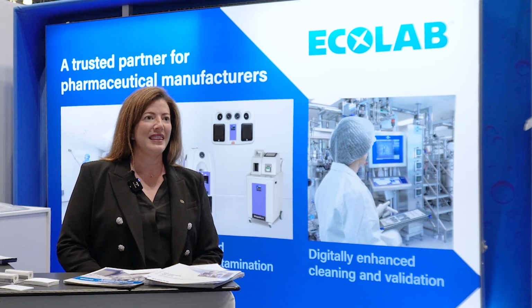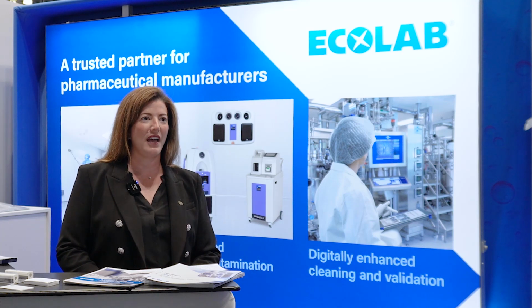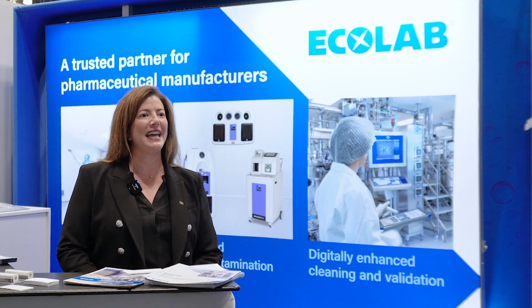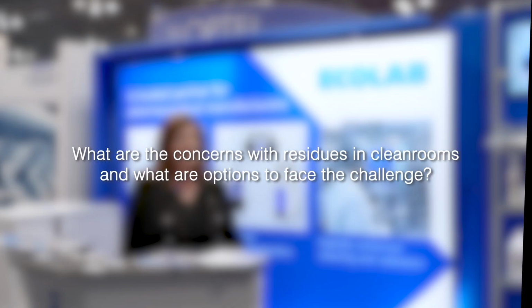And finally, the Annex clarifies the term cleaning and disinfection. And we feel this is extremely important because the role of cleaning helps get to that surface such that the disinfectant can be more effective in the outcome that it is intended to deliver.